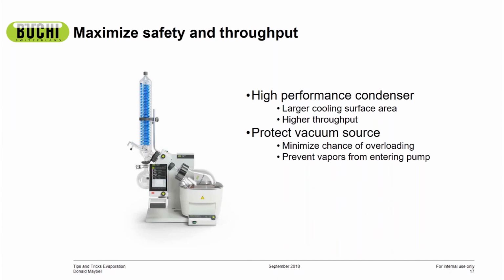And this allows you to deviate from the Delta 20 rule a little bit. So even if you have your temperature at, let's say, 5 degrees Celsius, you don't necessarily have to have your heat at 45. You can go up a little bit more to really send those vapors over there, because there's enough retention time with the coils to pull all that energy out.